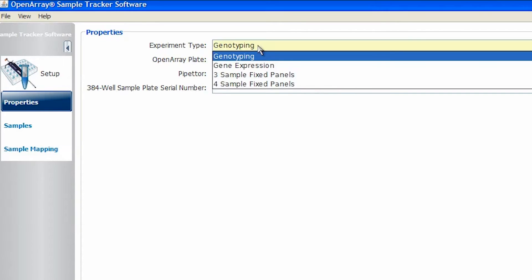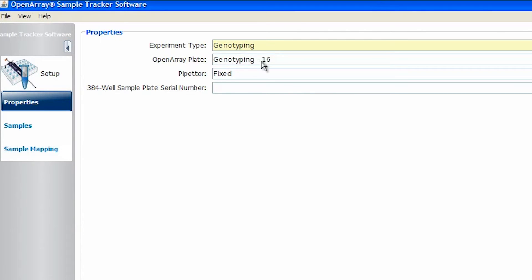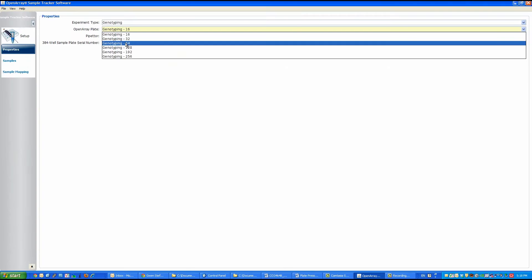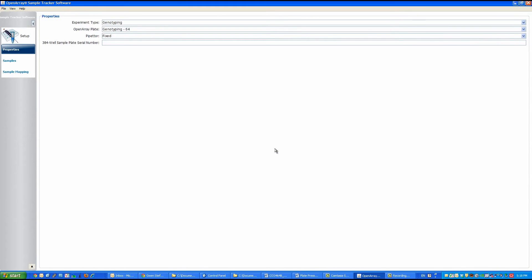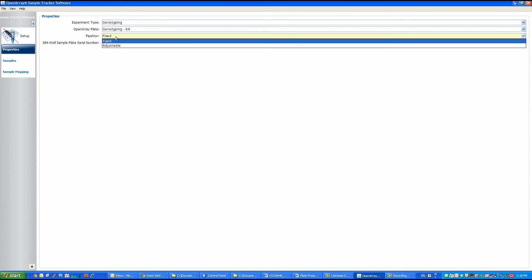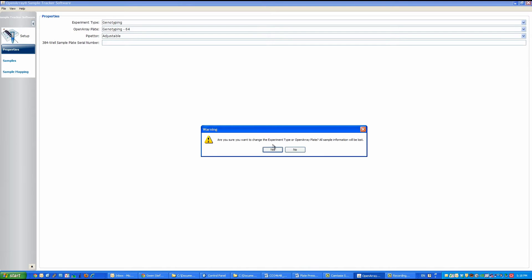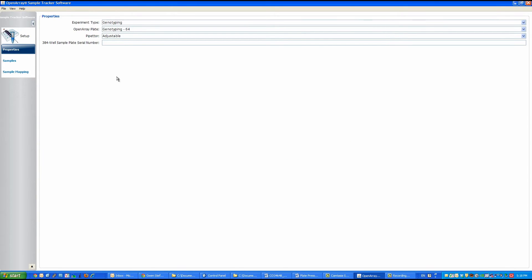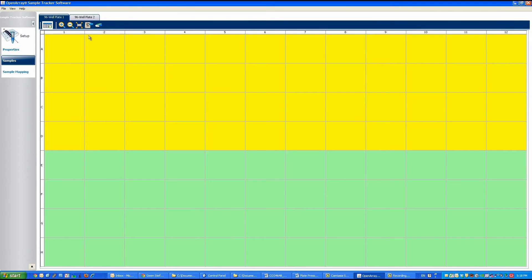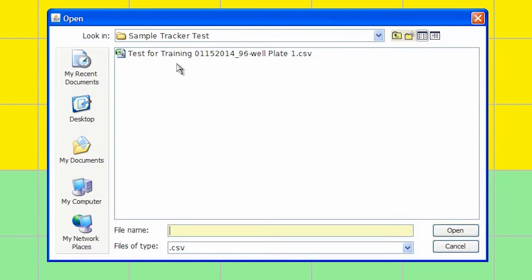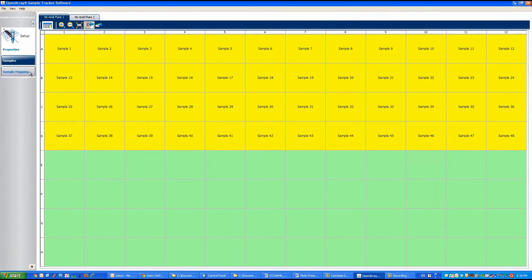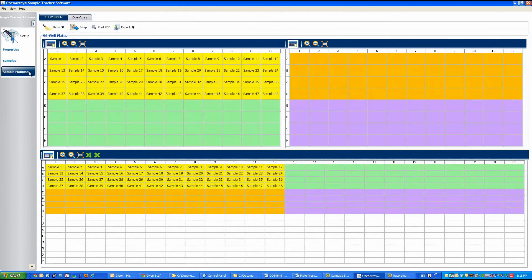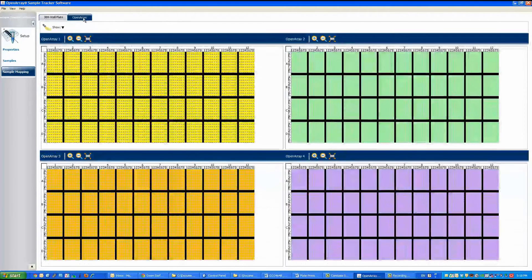Let's take a closer look at an example. You're trying to set up a genotyping run and you would like to have one sample assigned to each subarray. For this case, you will select genotyping 64, as one subarray has a total of 64 through-holes. Once you have selected your experimental properties, you can go to the samples page and enter your 96-well plate layout. Then continue to the sample mapping plate where the software automatically updates that information into the OpenArray format. Suddenly, those 3,072 through-holes don't seem so scary, right?